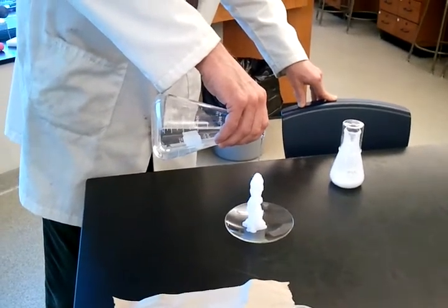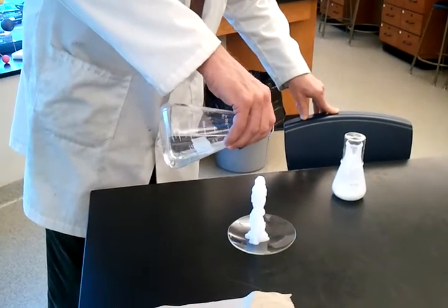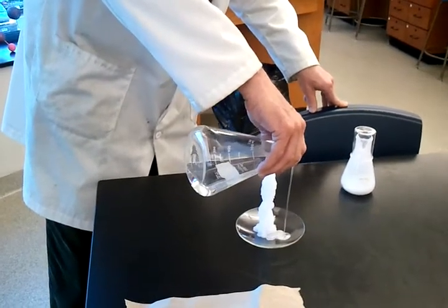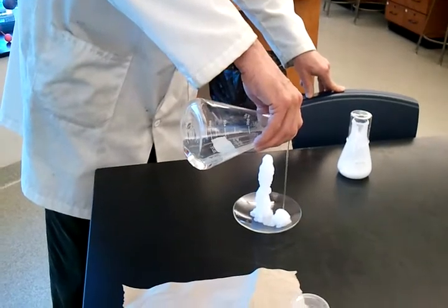And this would keep going and going and going until I run out of solution. I can actually make a little design too, building another little stalagmite on the other side of it.